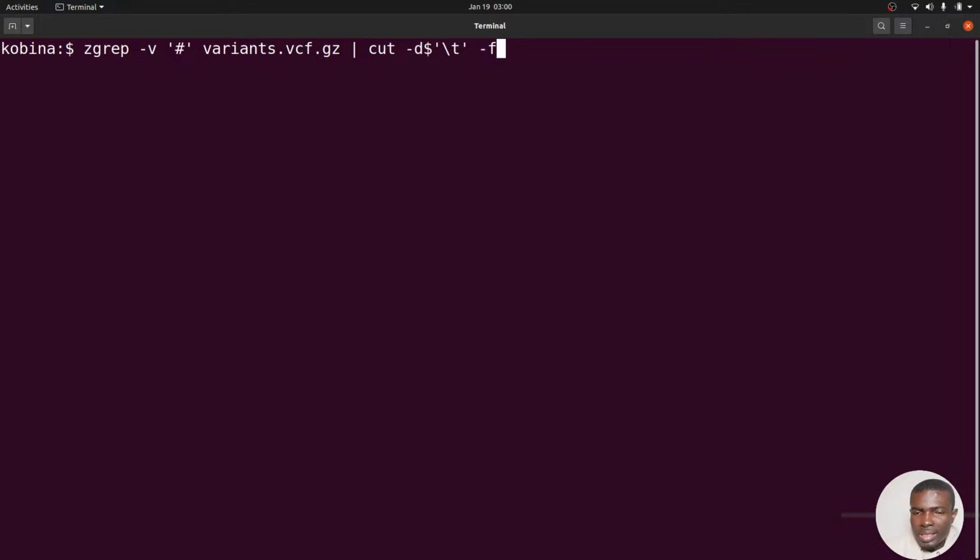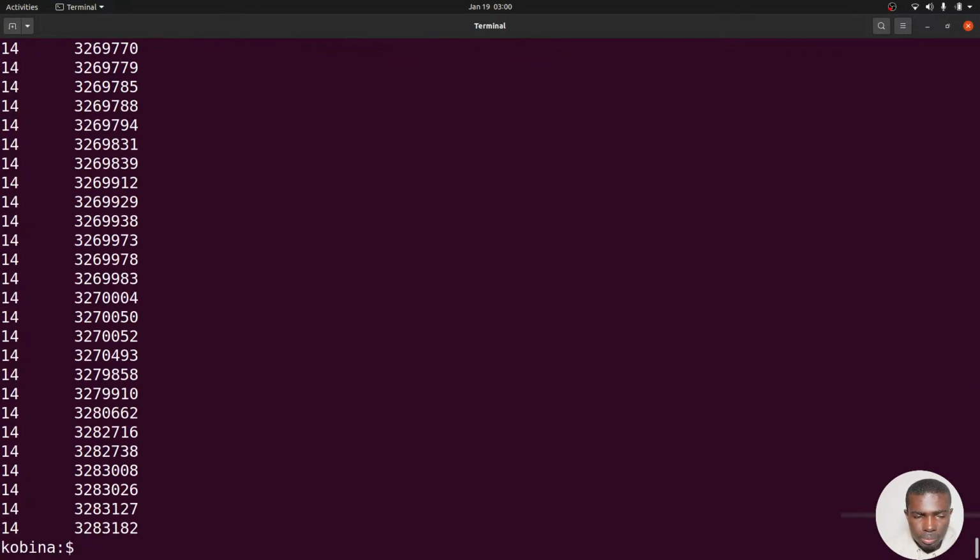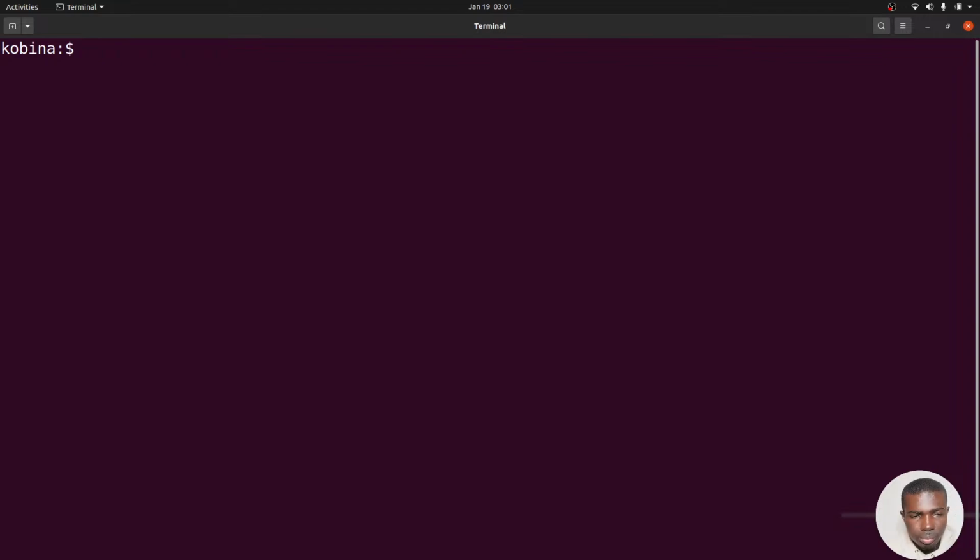So when we come here, -f, because we want the first and second column, 1,2. Let's run this command. Notice how that has also been done for us. Let me repeat again. This is the command.